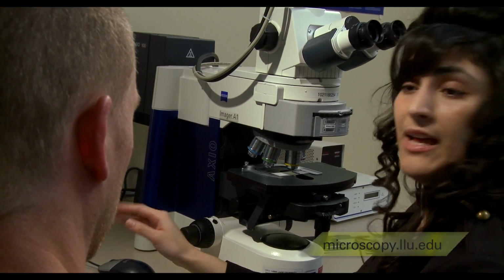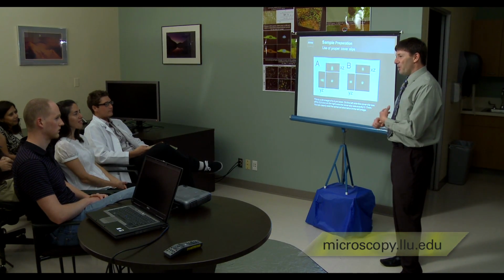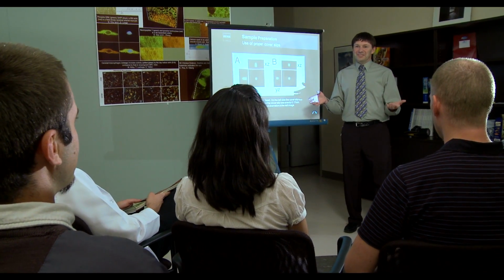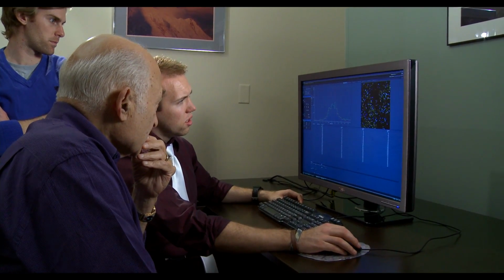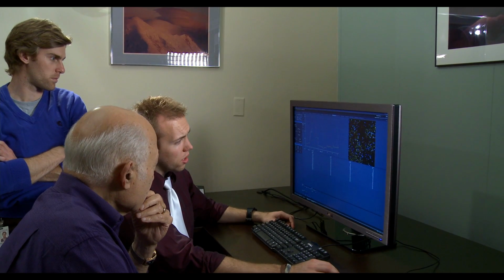The training session was really easy, and it was basically they went over all the stuff you needed to know, and then you just had to practice it to get it down. So within a couple of hours, I was able to come in by myself, image things, and get really, really nice quality images that were actually publication grade. They have set up a system here where they train you, they work with you, they trust you, and they make it accessible.